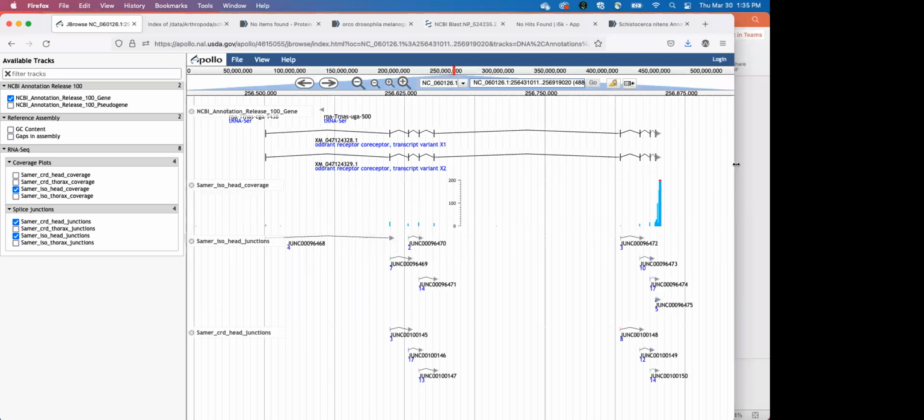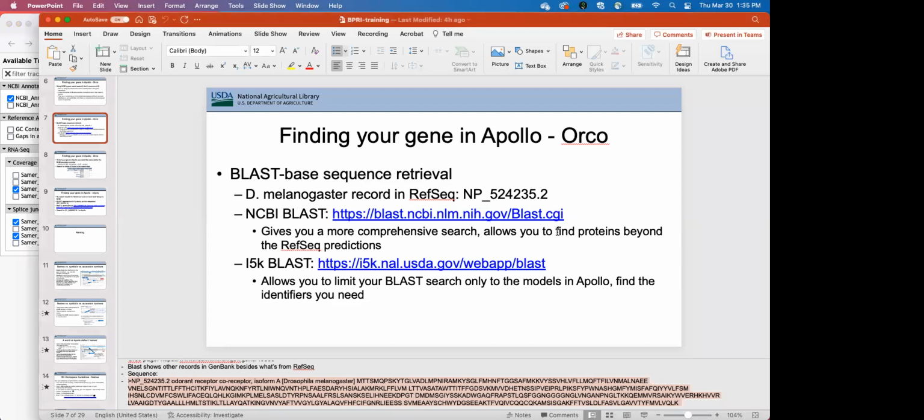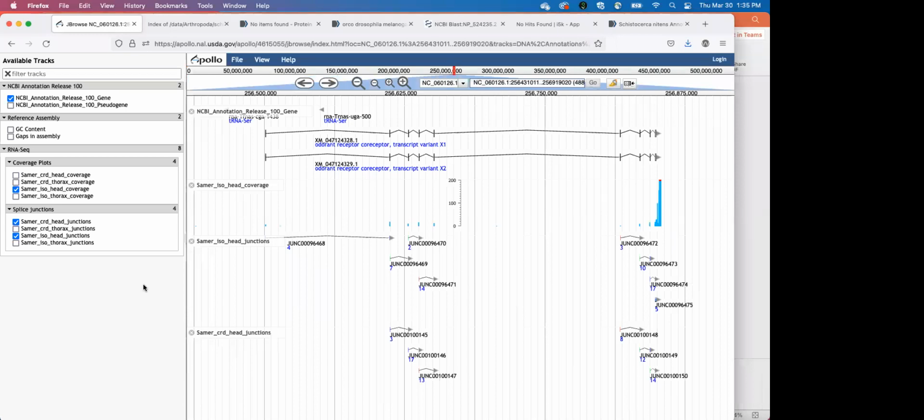All right. And so, Hojun, to your question as well, it's possible that you have a reference sequence and there is no protein that has a good blast result to this. In that case, you might want to search against the genome sequence to see if it's just not annotated.